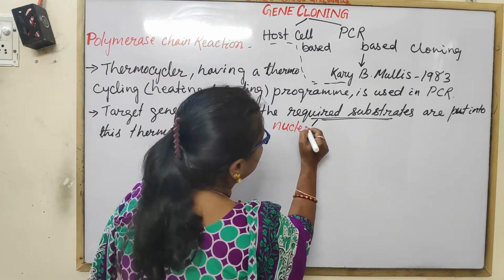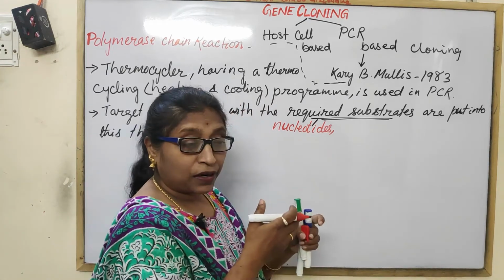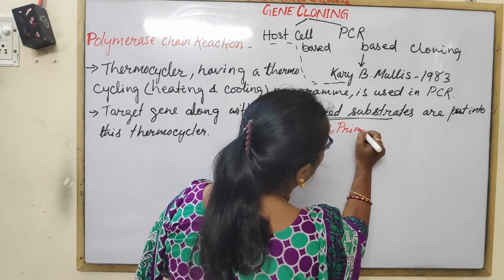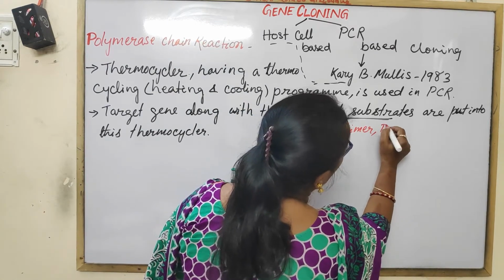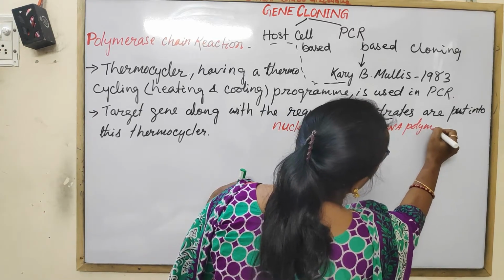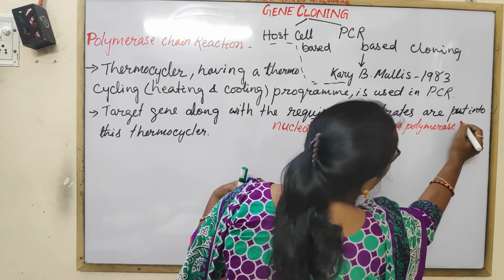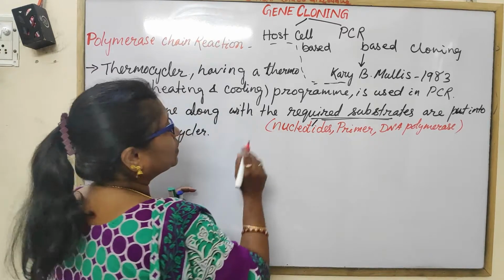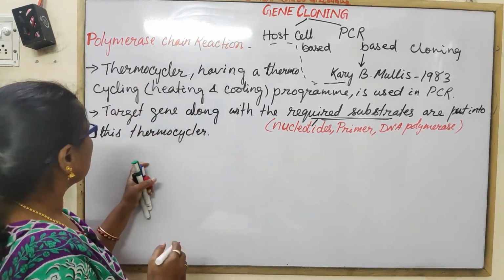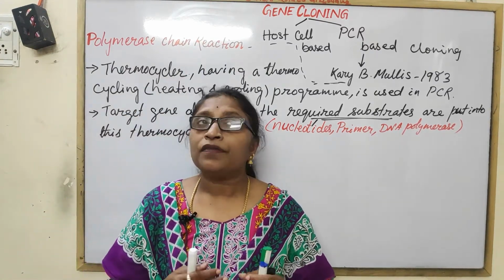So we need nucleotides, we need the DNA primers, and we need the DNA polymerase, the enzymes. The primers, the enzymes, and the nucleotides. These substrates are required.